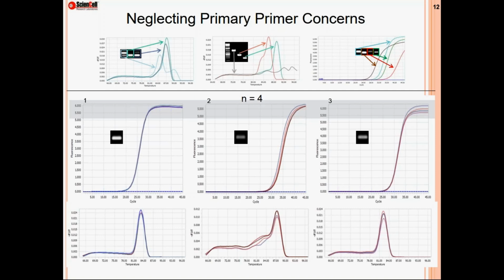Primer set 3 from the right column again looks fine based on amplification curves, melting peaks, and its band. However, the final fluorescent signal is variable. This is likely the result of inconsistent pipetting during sample or reaction preparation, reinforcing the necessity of good lab habits.